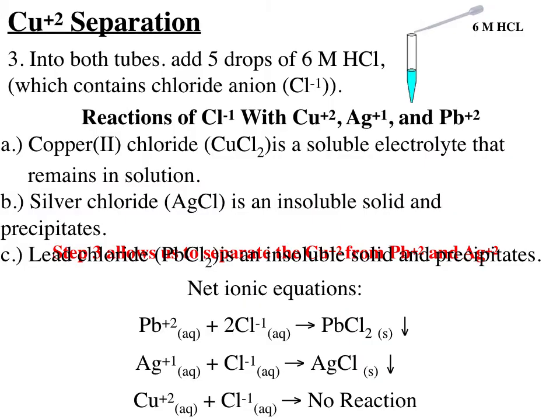Okay, so our test tubes have ions in them, and remember, the practice tube has all three ions for sure. The U tube, or the unknown tube, may have three or has a number yet to be determined.